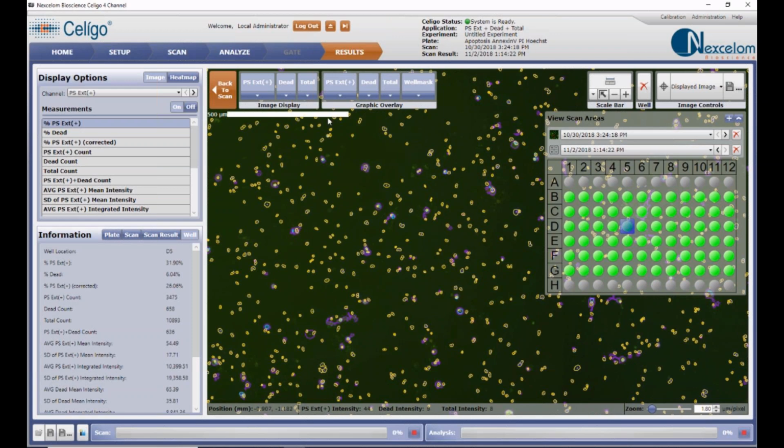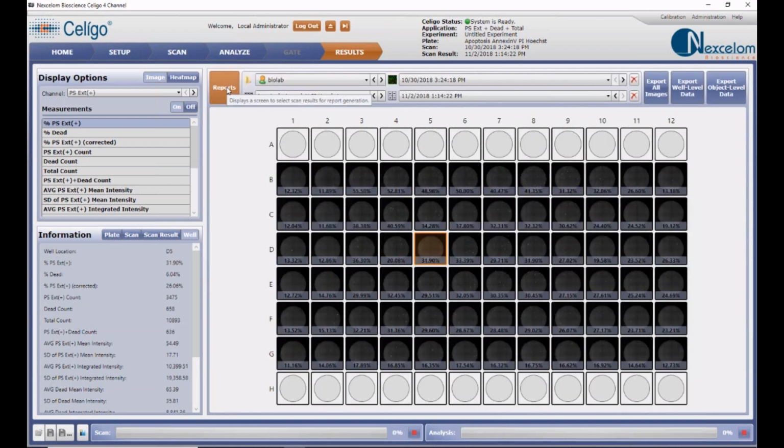And also for the fact that we're not washing out the cells, because sometimes these kits ask you to remove all of the media and then come in with the buffers, you have the tendency to move cells around and lose some of your dead cell counts.